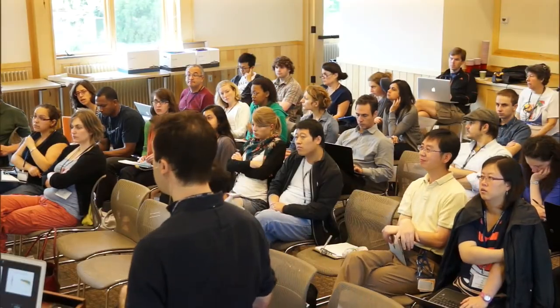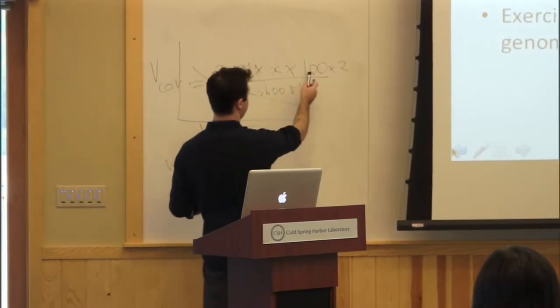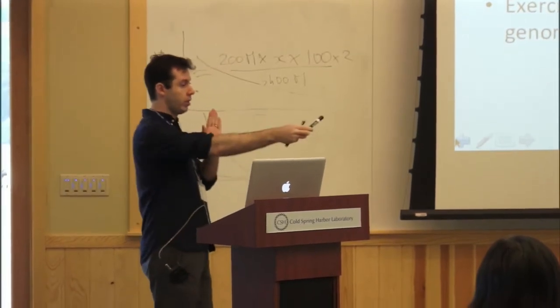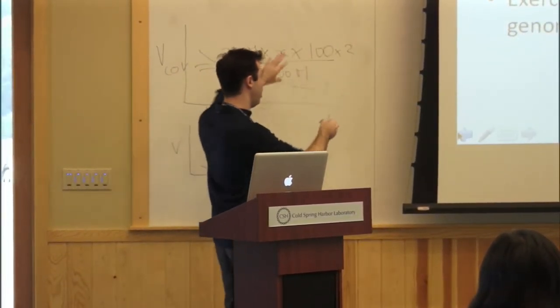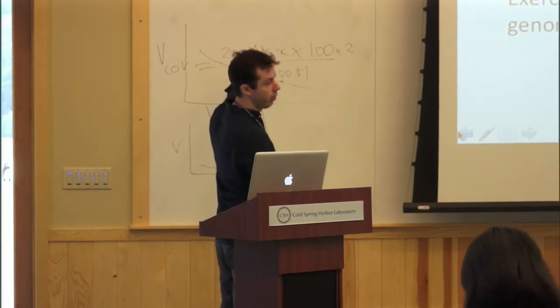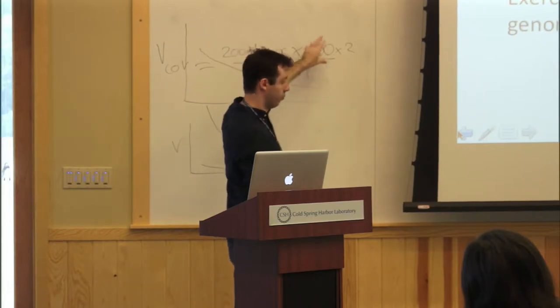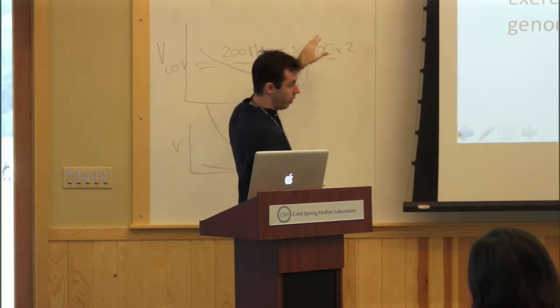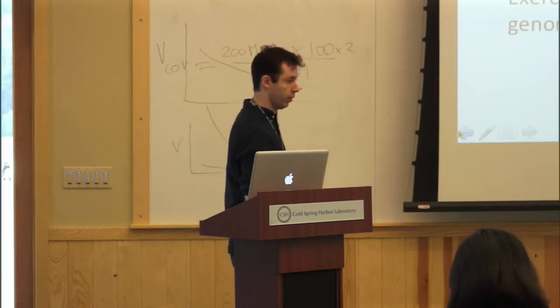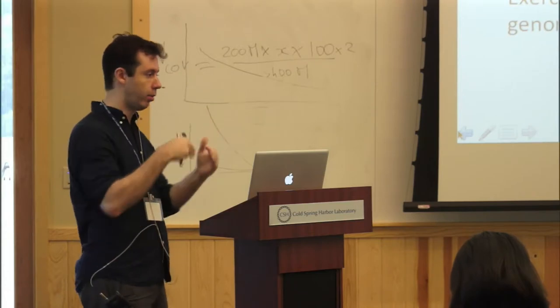Yes, so the read length is this, basically. The longer the reads, the larger this part is, and therefore the higher your coverage becomes. So this is something that you want to tune. If you want to get more coverage, you can increase that number so as to get more reads that overlap with each nucleotide.